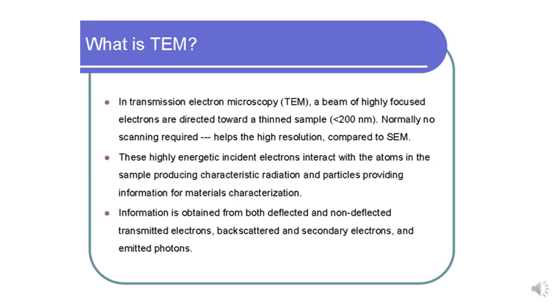You need to know that your sample must be very, very thin. When we want to use TEM, we first prepare our sample, and after that we can run our sample. We can say that TEM has a higher resolution compared to SEM.